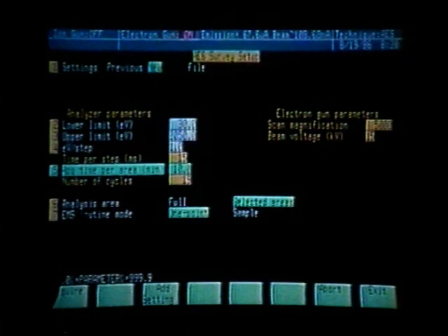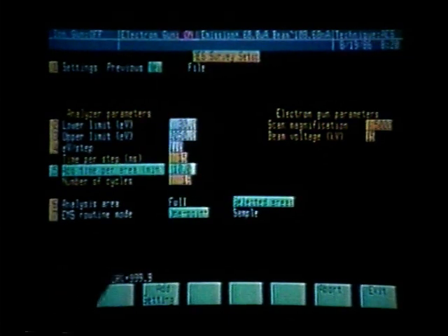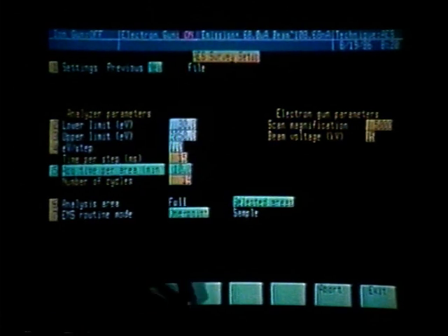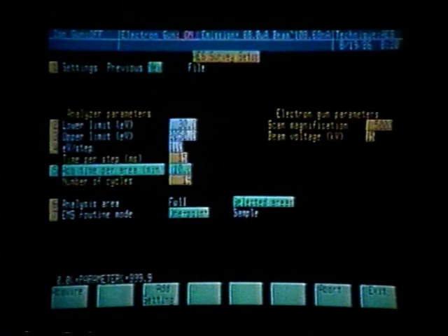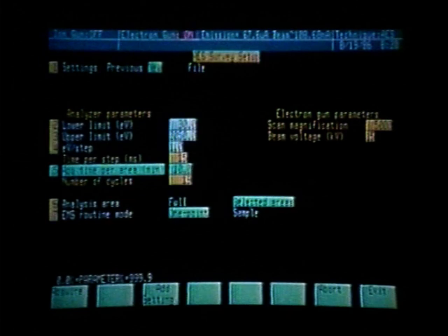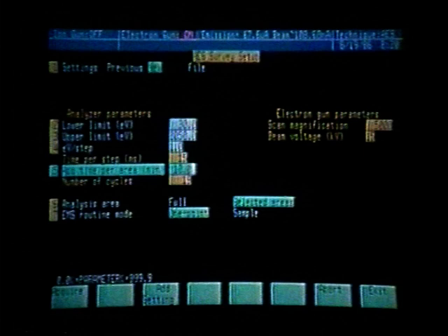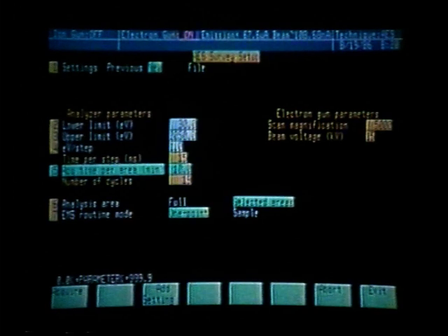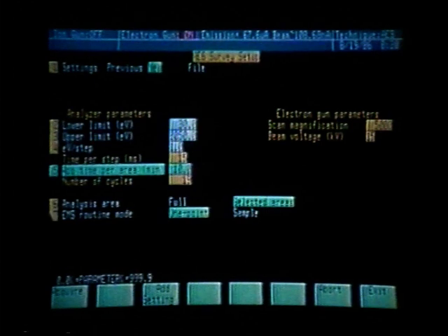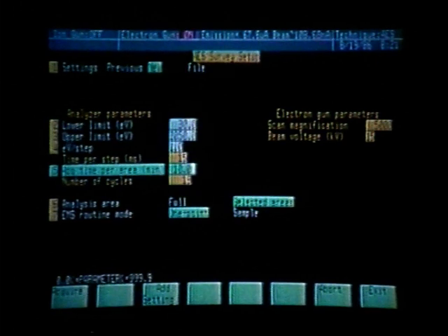Line number 6 asks what analysis area we wish to use. We can do a full analysis area, which would raster at TV rate over the area at whatever magnification we have set up on the TV, signal averaging that area so the survey scan comes from one area at the displayed magnification. What we want is selected areas because we have three different areas already defined, so we will leave that in the selected areas mode.